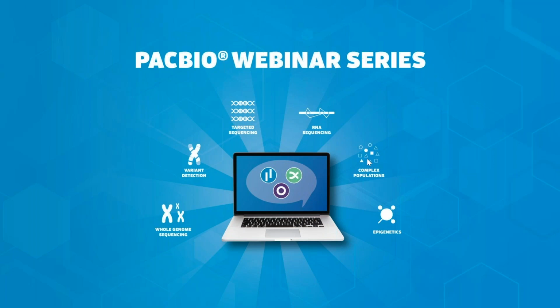Okay, then we have a couple questions about multiplexing on the PacBio. There's a question about how many samples can you multiplex on the Sequel II. So for 16S, you can multiplex 96 samples by following exactly the protocol that we've released or using the Shoreline Biome Kit. And then in terms of capacity, you can multiplex as many as 192 samples and still get at least 10,000 reads per sample doing that. And for shotgun sequencing, we have multiplexed as many as 8 samples, though I think 4 or 3 is probably a more typical number for human metagenome samples like the gut microbiome.